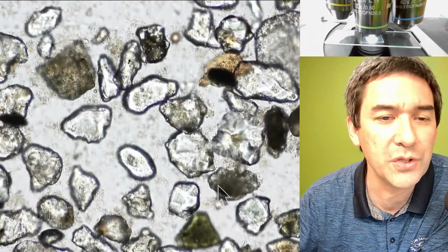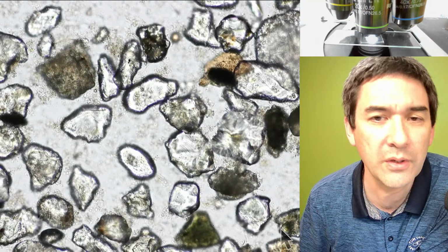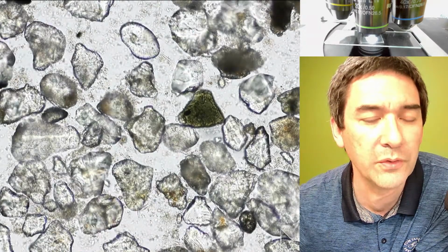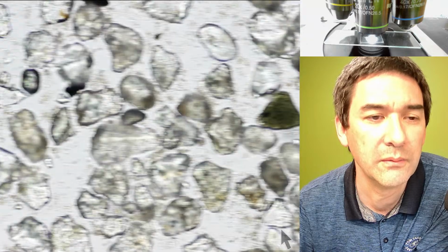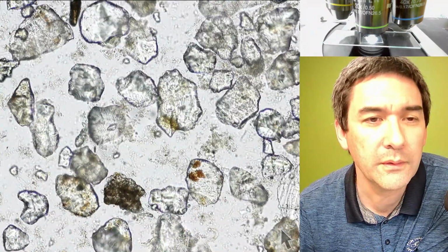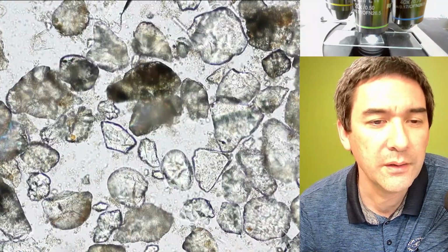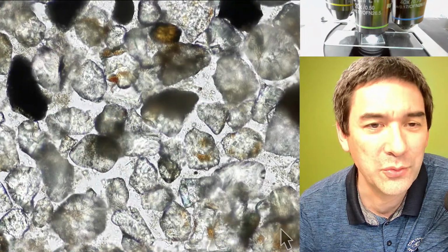Sometimes this is also a good setting to use, because this way you're able to see if there are green things around, because everything that's green often contains chloroplasts and does photosynthesis. But I think we all agree that this sample did not survive 2 years.